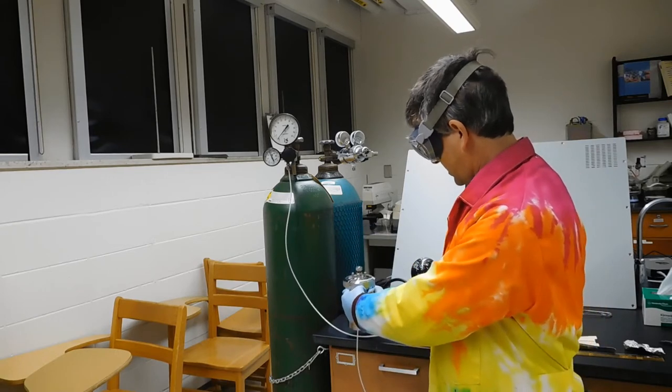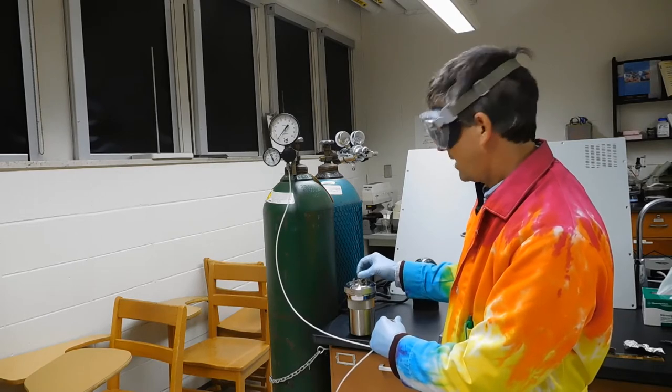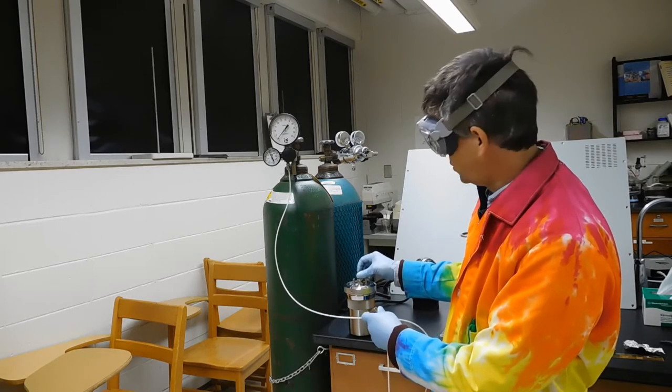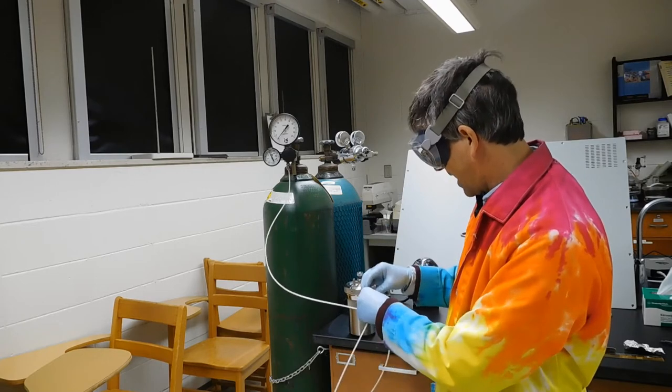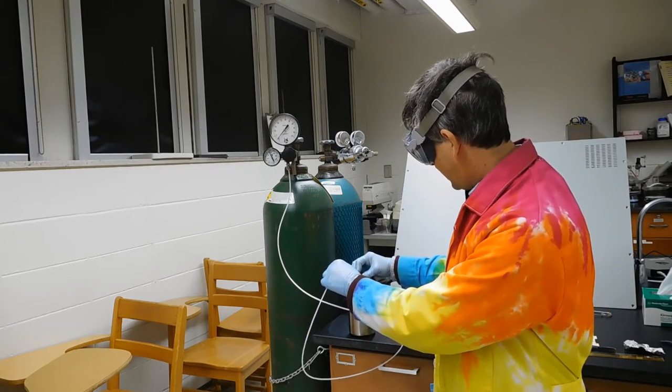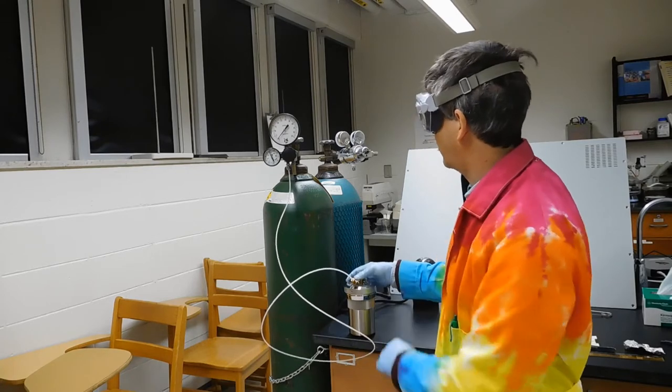This screw top right here is the release valve, and before you start this process initially, you do want to make sure this is open. Don't unscrew it too far. It'll screw all the way out. We don't want to do that. Then you can slide this on. Make sure you slide it down so the second seal will be sealed.